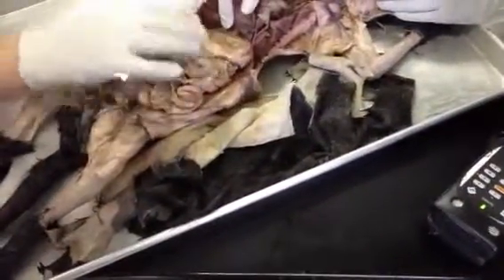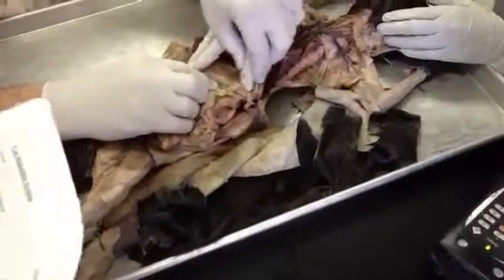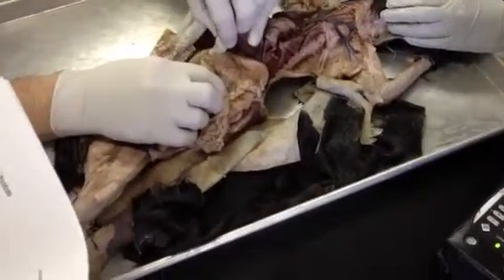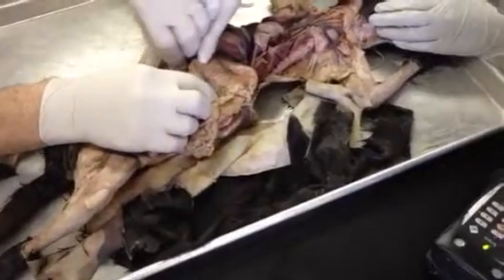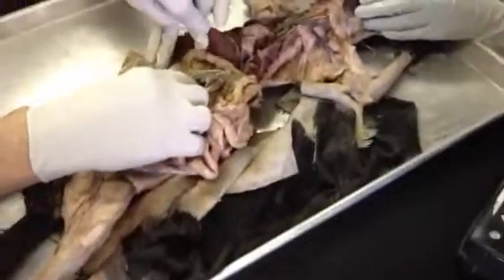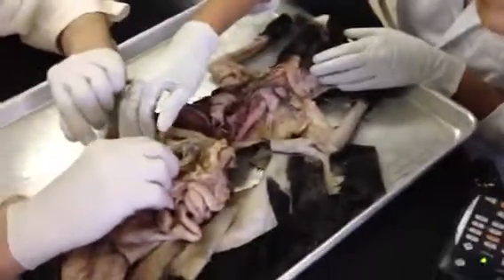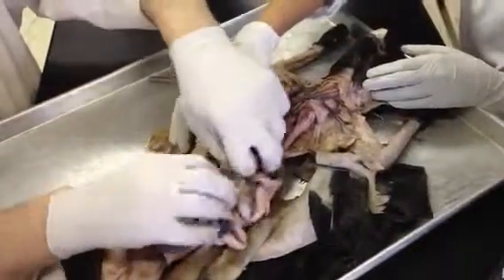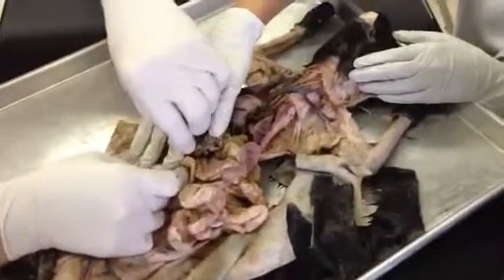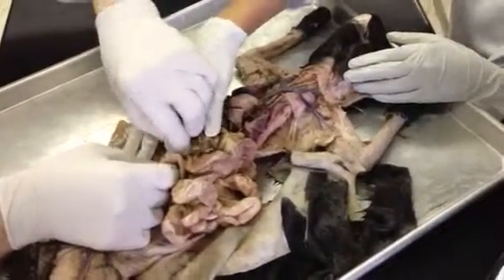Now, let's take a look at the intestine. There's the stomach again. Greater curvature of the stomach. Coming out of here is the pyloric region. Coming out of the pylorus is the small intestine. The first part of the small intestine forms a U-shaped curve. It comes out and bends around and heads back in the opposite direction. That's the duodenum. Right here, here's the duodenum. In the curve of that duodenum is the pancreas. That's the pancreas right there.